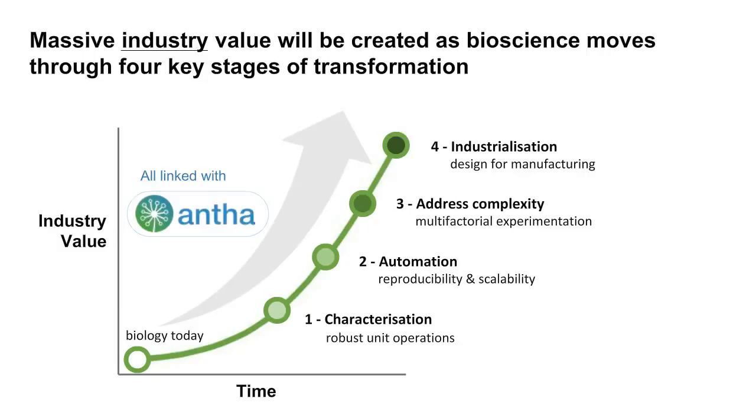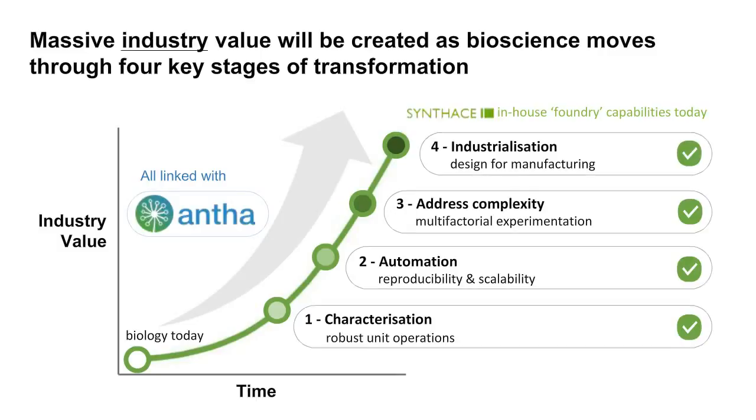On the other hand, if your fundamental working practices are reliable and robust, automation is a force multiplier. It means that all of a sudden you have the potential to flexibly execute complex experiments that give you sufficient experimental bandwidth that you can properly apply multifactorial experimentation to unpick definitively what's going on in a biological system. And of course, being able to build successful models about what is going on in these biological systems means that you can properly start to engineer with biology, which is a critical bottleneck in our ability to apply it in areas such as industrial biotechnology.